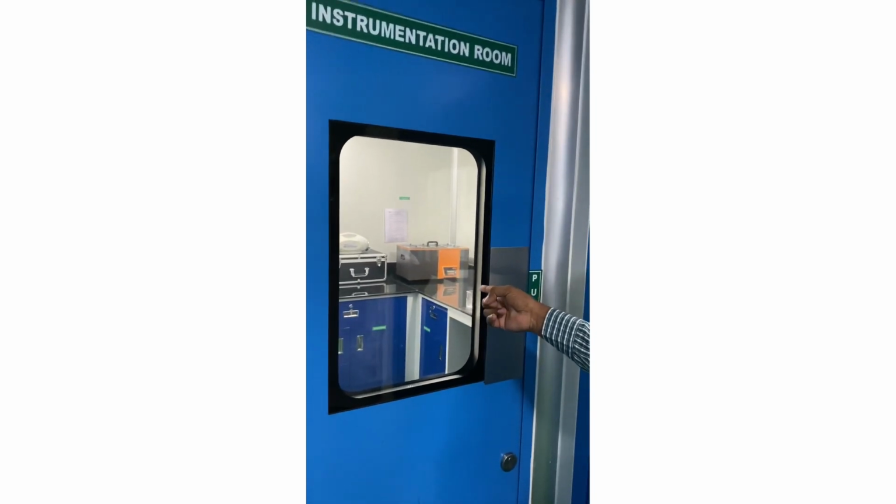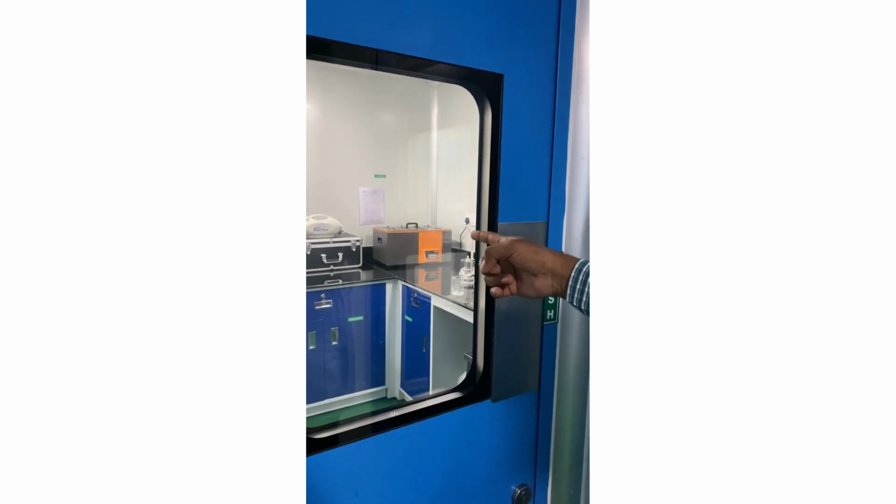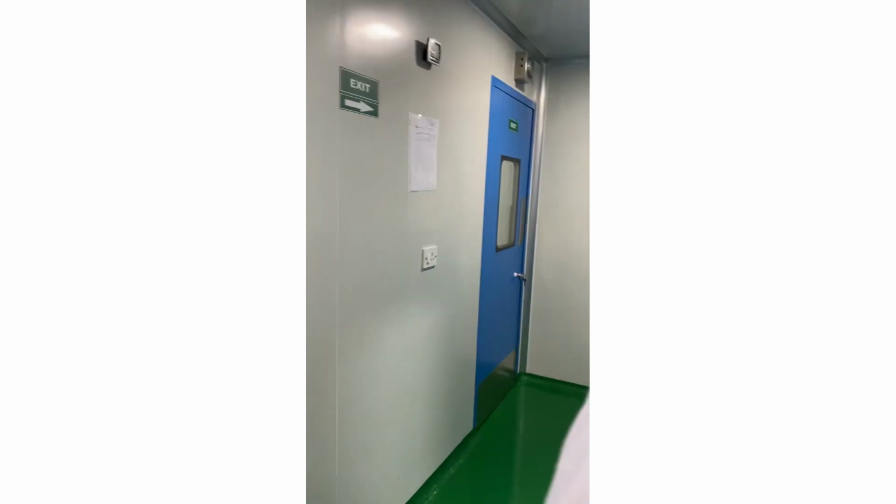And this is the instrumentation room. We have a microscope, air sampler, water double distillation unit, water bath and all. This is the decontamination room, where we kill the organisms, and then the washing area. Then the exit.